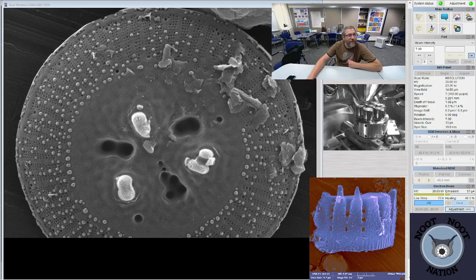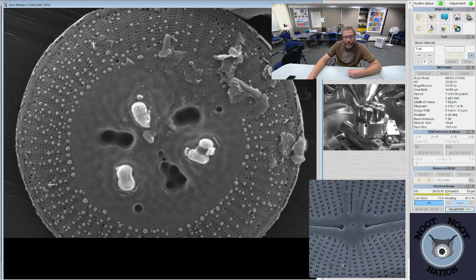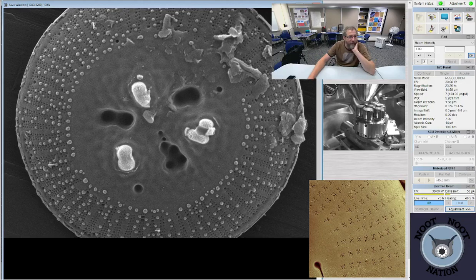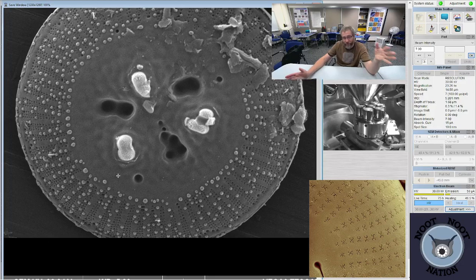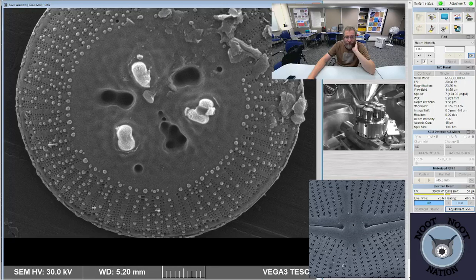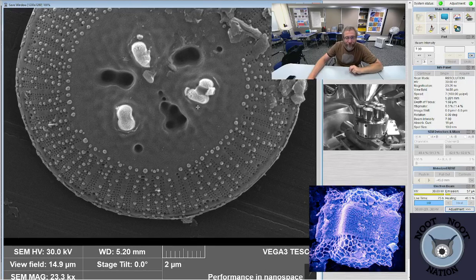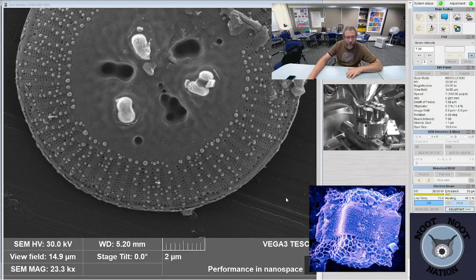Yeah, very cool. So right now we're just looking at some material from Jackson Lake, which is near the Grand Tetons. And this isn't what the student asked me to look at. They sent me some stuff and asked if I could check to make sure that what they were seeing was Stephanodiscus, or whether it was Stephanodiscus or Cyclostephanus dubius. And I've only seen Stephanodiscus so far, so I think maybe what they were seeing was a Steph. I'm going to take these samples and also make some light microscope samples from them, so I can check them out in the light microscope and take some pictures and make sure that I'm seeing what they thought I was seeing, or what I should see.